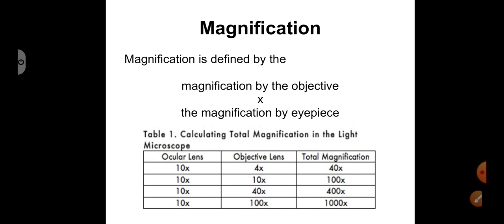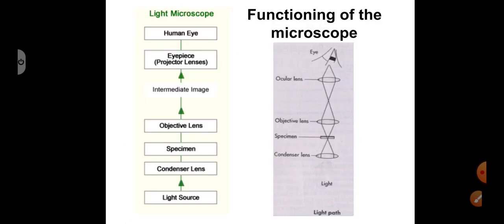separate objects. Similarly, another term we have to know is contrast. Say you're taking a picture with the camera. If it's a black and white picture, the image is black and white. But when you take a color photo, there's contrast. So this contrast in a bright field microscope is obtained by using certain stains or dyes which color the microbes. Okay, now let us move on.